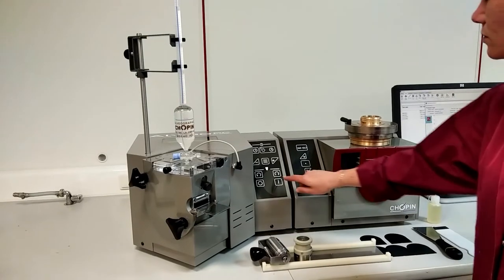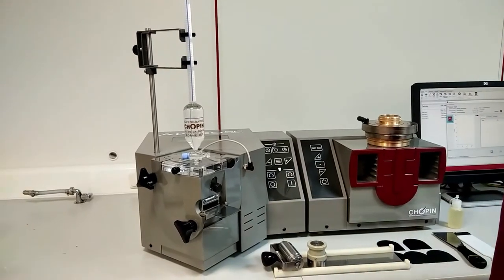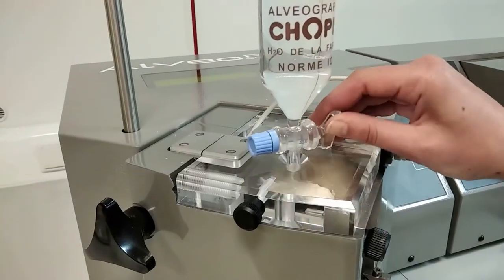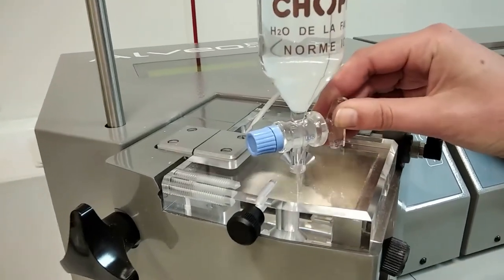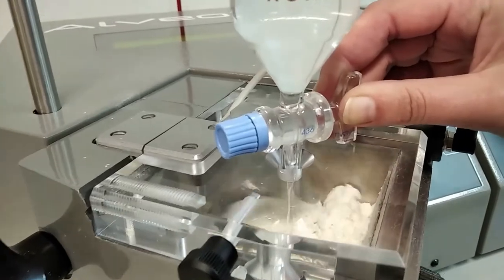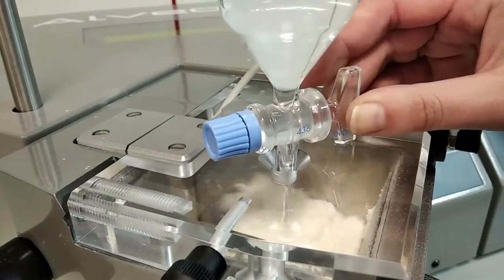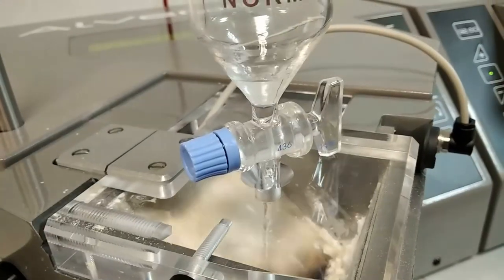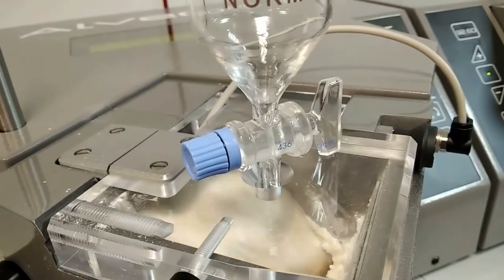Start the mixing by pressing the mixing button. At the same time incorporate the salted water using the burette through the hole in the cover. Once the injection is complete remove the burette.